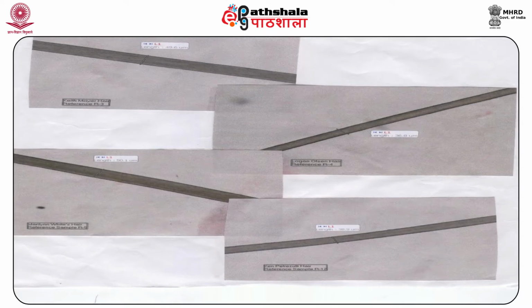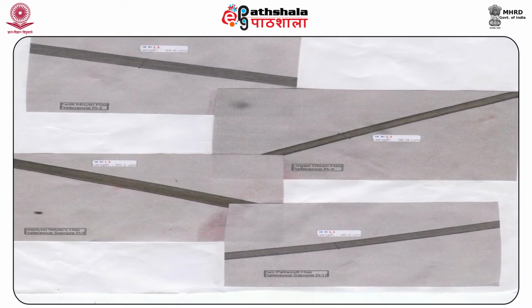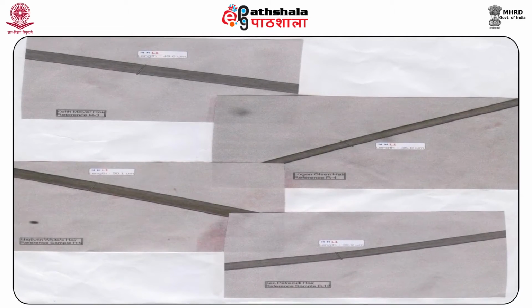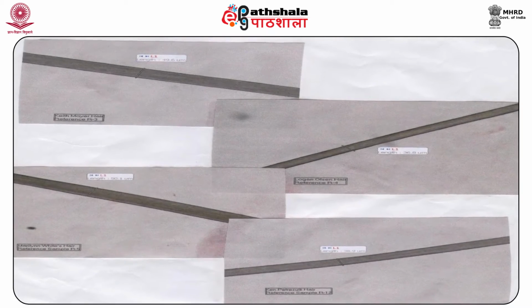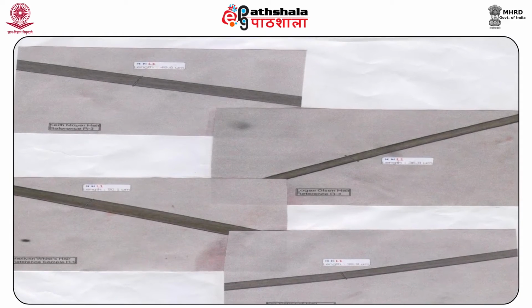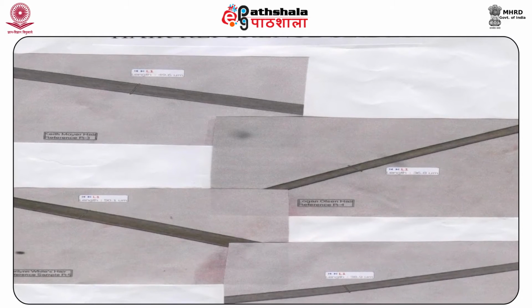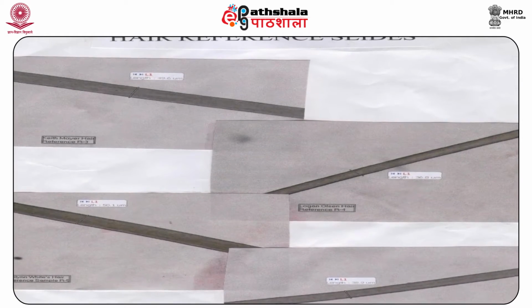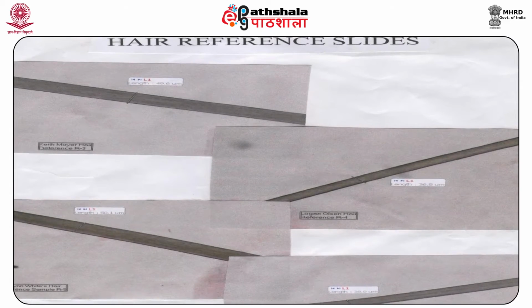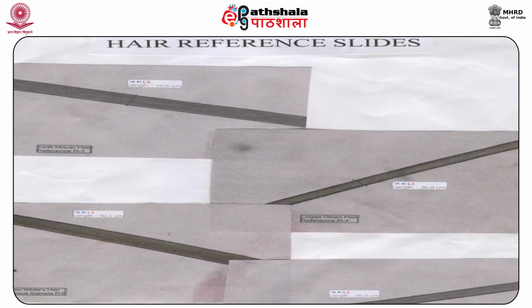Two compound light microscopes are connected by an optical bridge in the comparison microscope, which helps in the simultaneous viewing of the questioned and the known hairs. A glass microscopic slide with the known or reference hair sample is placed on the stage of the other microscope. This helps in comparison of the microscopic characteristics of the known and the questioned hair samples. The range of magnification commonly used is approximately 40x to 400x.